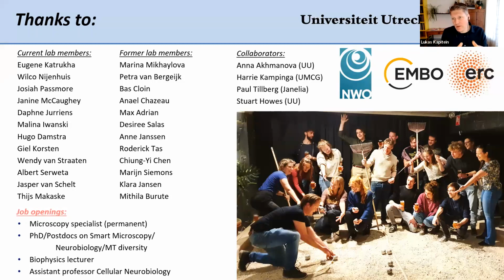So we have a concentration range of expression that you should use to not have artifacts. It's all in the paper. We were quite happy that we were able to get a stable cell line that went through mitosis and showed no mitotic defects. And the stable microtubule network is disassembled at the onset of mitosis and re-emerges. So we are fairly confident that when used properly, it will not cause too much defect.